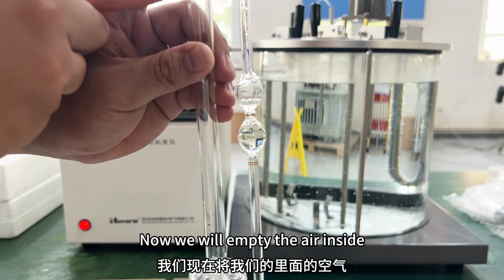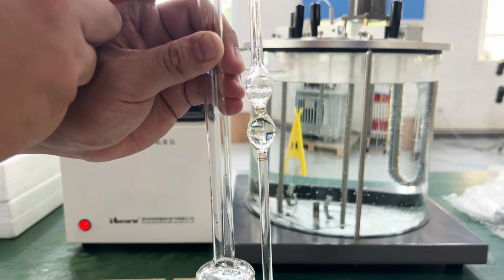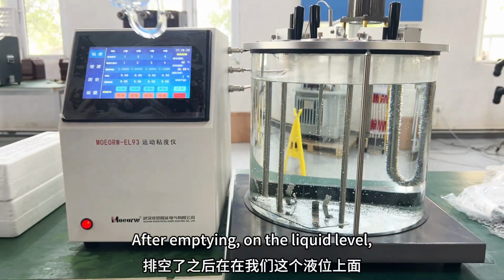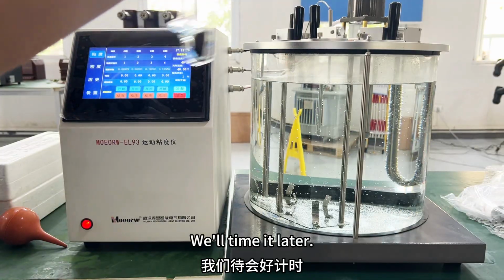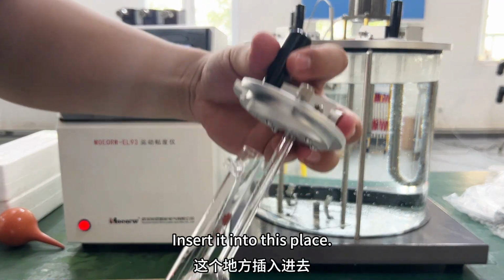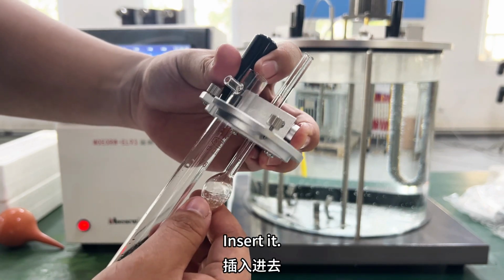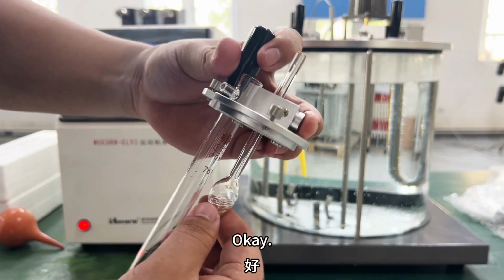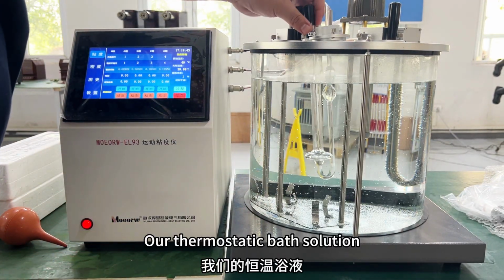Now we will empty the air inside. Okay. After emptying on the liquid level, we'll time it later. Insert it into this place. Press the switch next to it. Insert it. Okay. Then put it into our tester, our thermostatic bath.